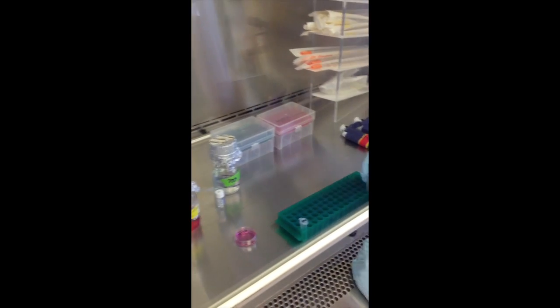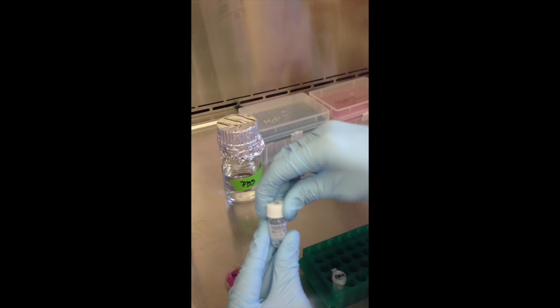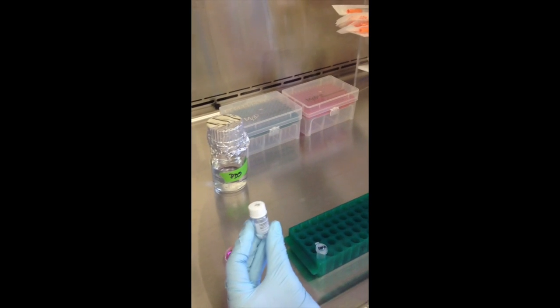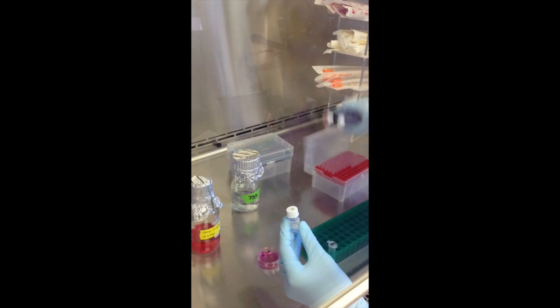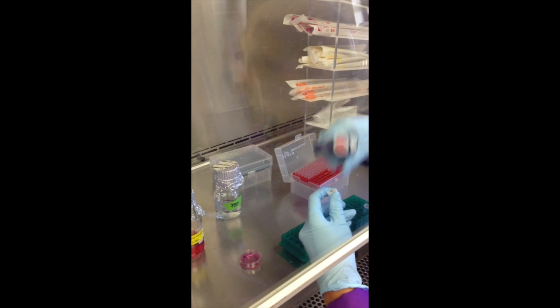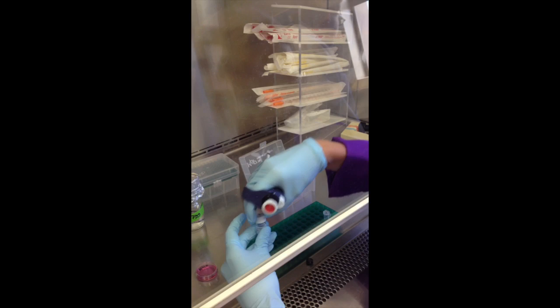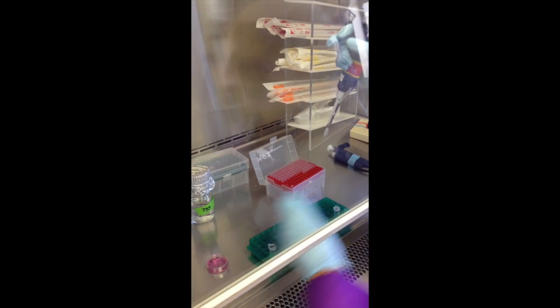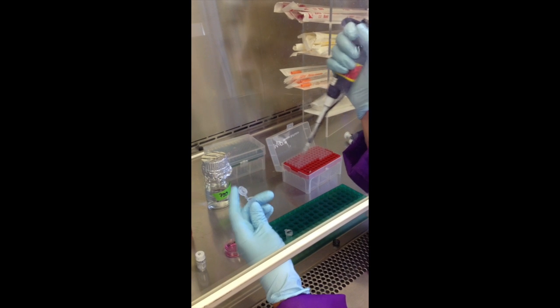Now we're going to add the transfection reagent. Here we have Fugene HD. The protocol for each transfection agent shows you how much to add, so we're going to add a certain amount. It's really important to add the transfection reagent into the media so it doesn't touch the plastic.